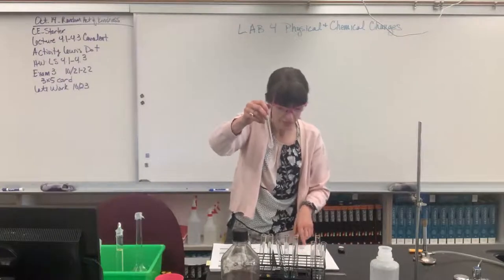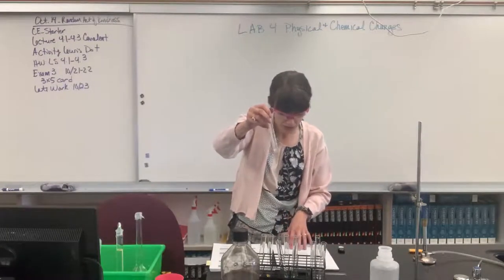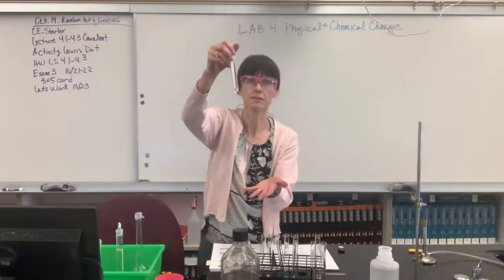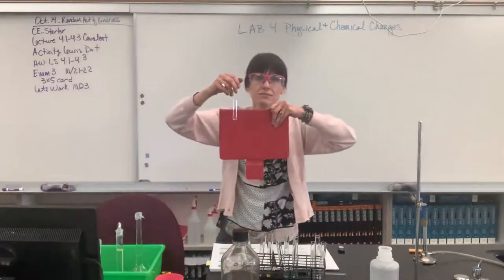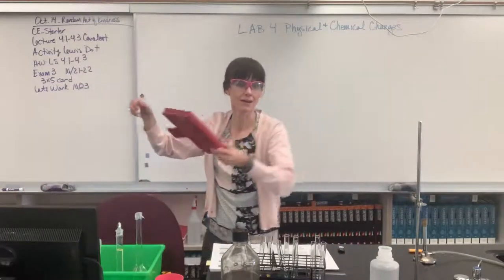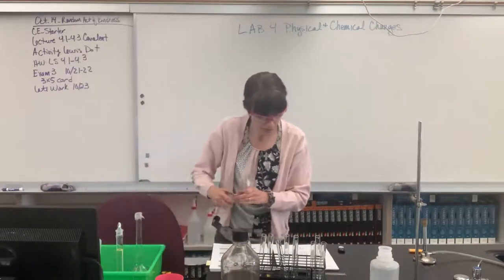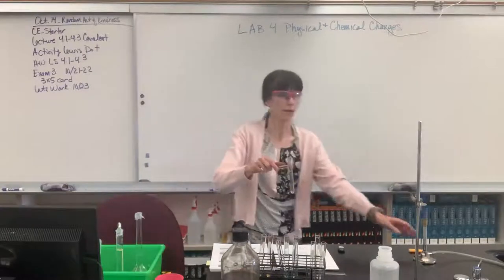Okay, and this can be done. You can see the model. It can be done by tilting the test tube gently in the heating. So great, it's clear. In fact, let me show you with my iPad again. You can see it's clear. Yeah, it's not white at all like that other one. It's clear. I'm going to use my test tube holder right here, and then I'll pull the flame.